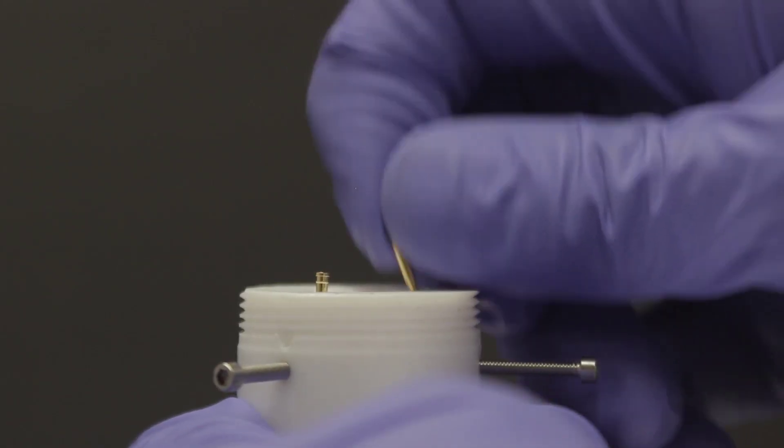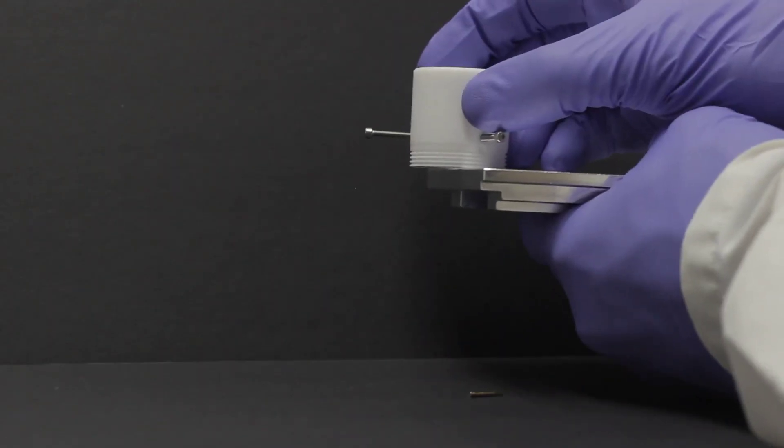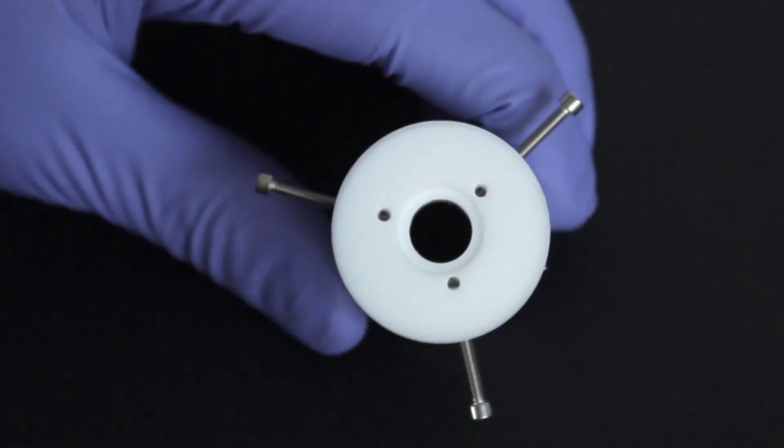If a pin falls to the bottom of a hole, tap the cell base on a hard surface to dislodge the pin. Then tighten the contact screw some more and reinstall the pin.